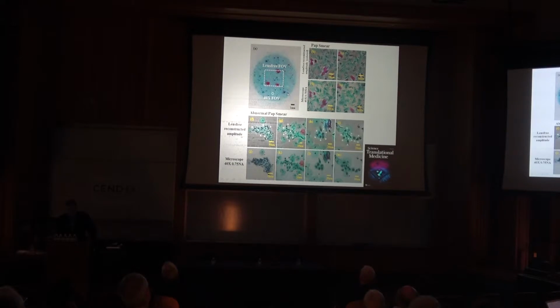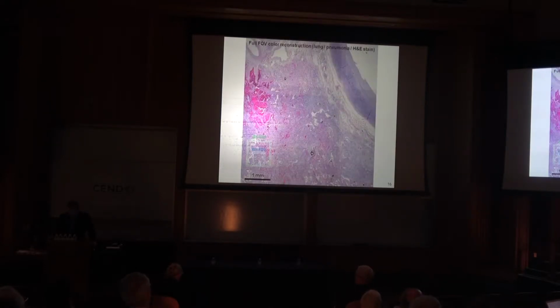That's why you wouldn't need to normally scan the sample and capture multiple images. The lensless imaging system essentially has a field of view that is sometimes 20, sometimes 30 millimeters square, depending on what kind of CMOS imager you use. And you can bring color imaging to this kind of system based on multicolor illumination. These are some recent results from the state-of-the-art for lensless imaging.